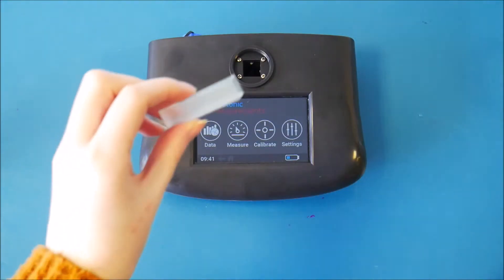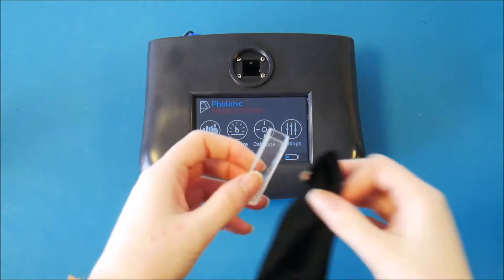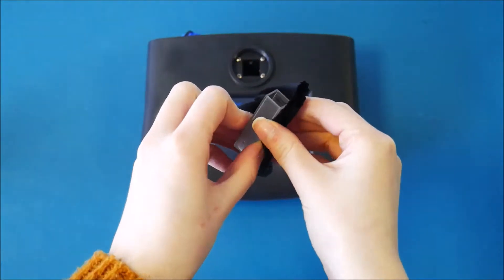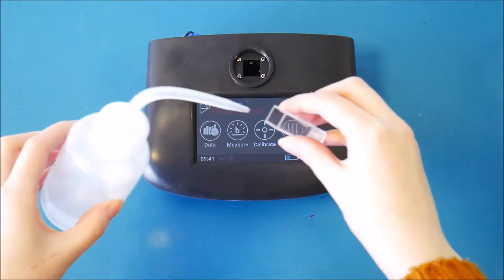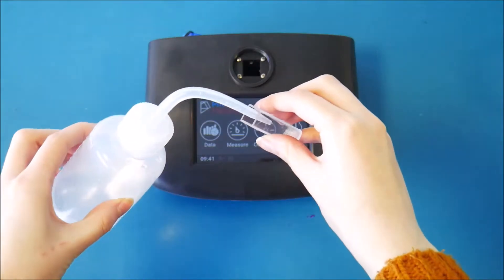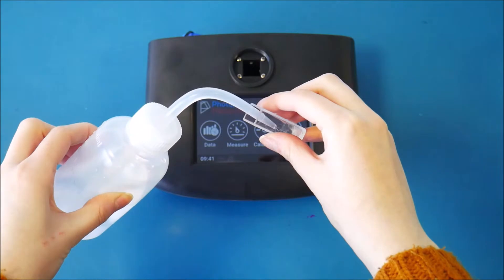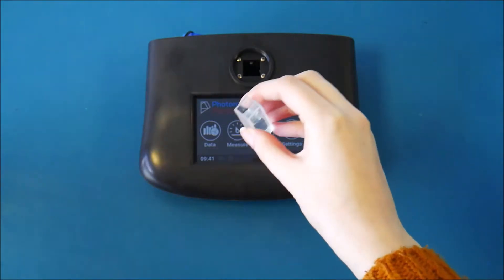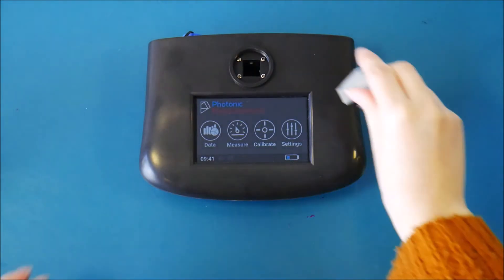Take the cloth and wipe the cuvettes to ensure no residue is left. Place three quarters of the sample into the cuvette. Give it a swirl and tap on the surface to remove any water bubbles.